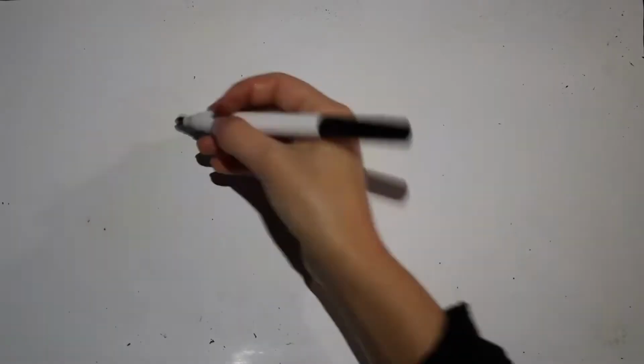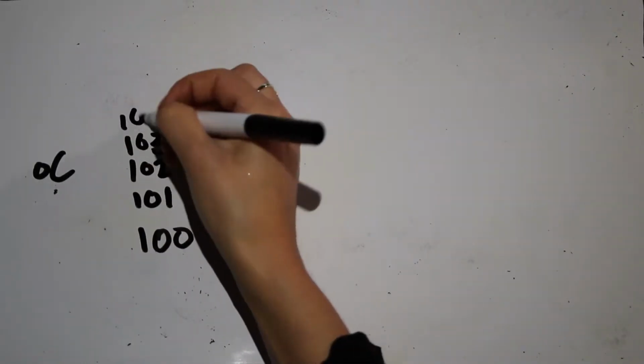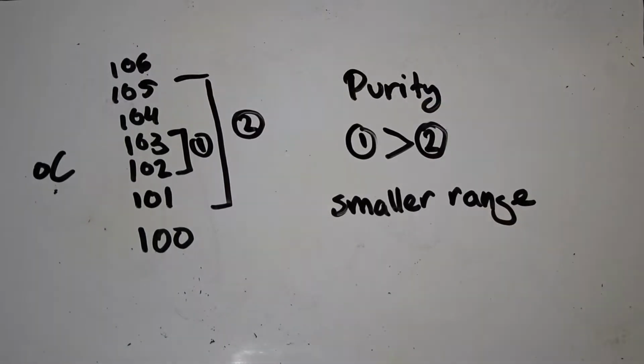The second reason to determine a compound's melting point, though, is for a rough measure of purity. In general, impurities lower and broaden the melting range. Because of this, you must report a range of temperatures over which the melting point was observed. You will lose marks if you don't do this, so it's worth remembering now.